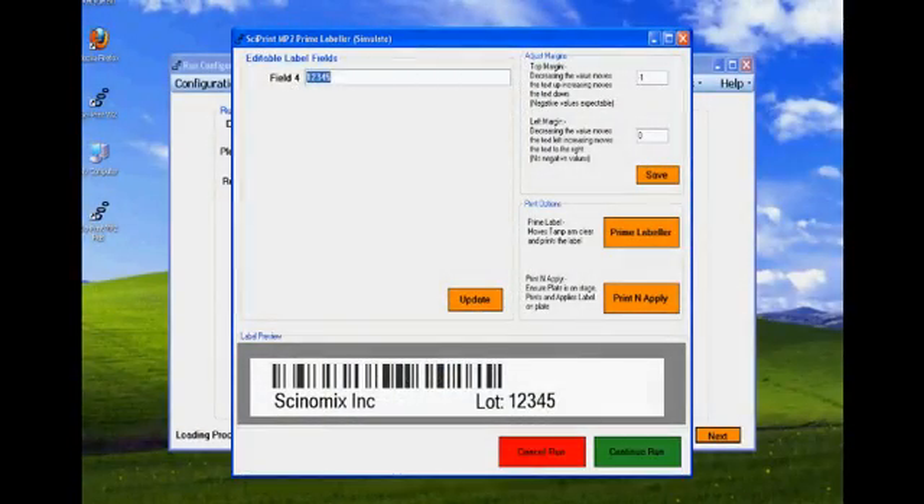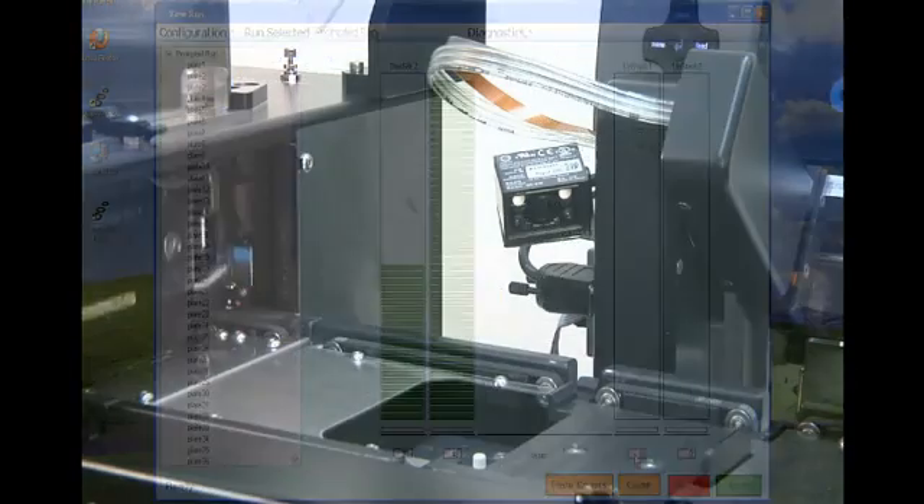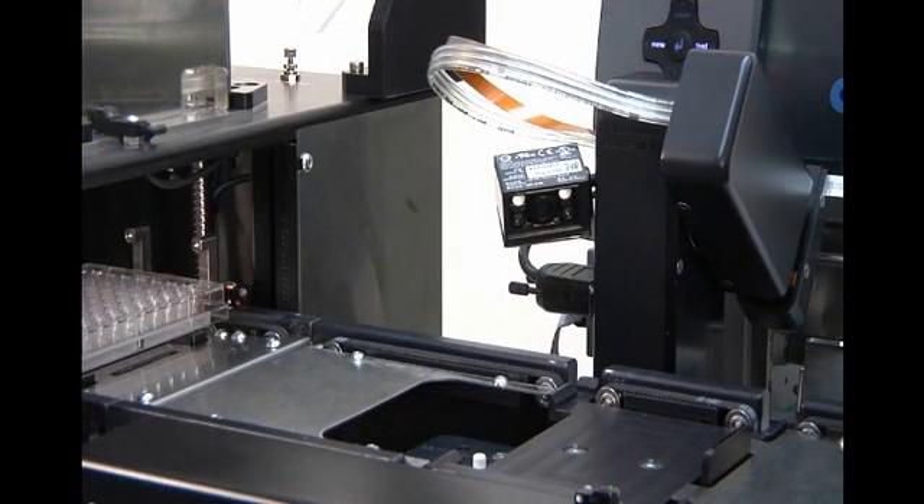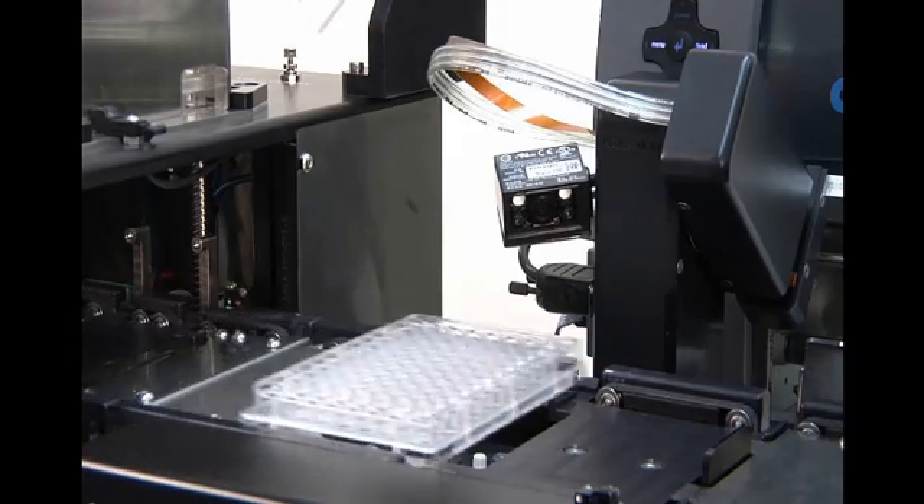Depending upon how the system is configured, run-specific label data can be entered at this point. The run is then started. Plates are lowered from the input stack onto a conveyor, which moves them to the labeling station.